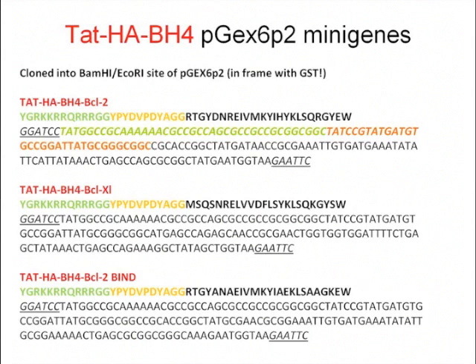What do you do if your peptide sequence is very hydrophobic? And what do you do if you use the His6 tag for the purification? Is there any possibility that the tag can be hidden? Shall I read that again?